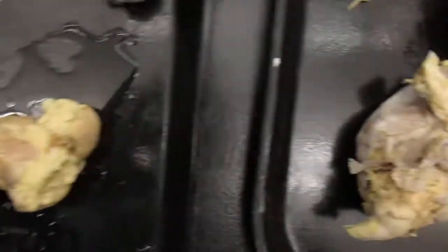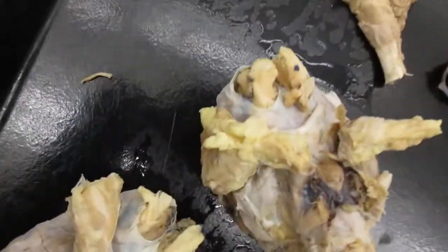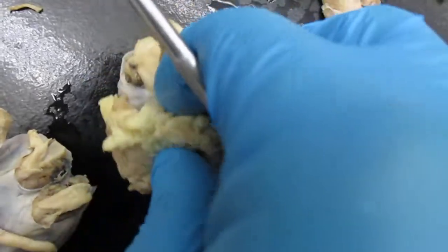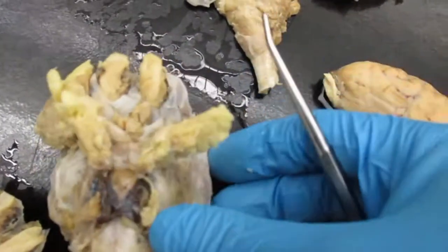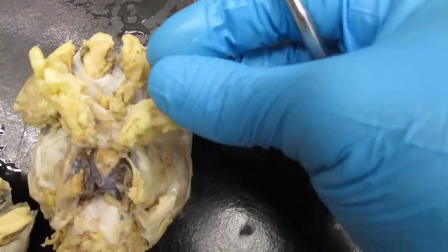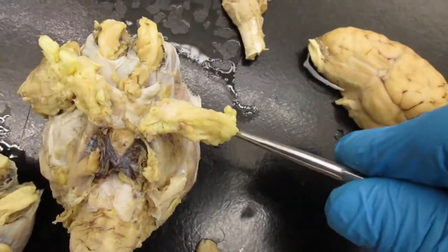If you look right here on the sheep brain, we can see the optic nerve right here. Here's the optic nerve, and I haven't removed the fat, so here's the optic nerves here and here.